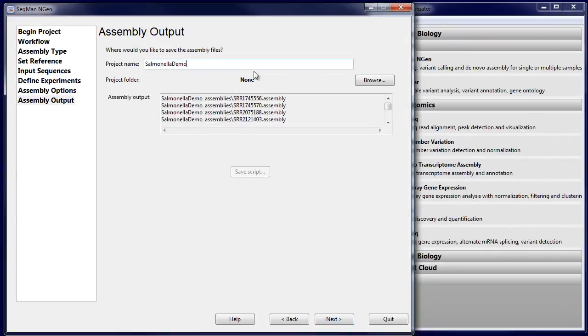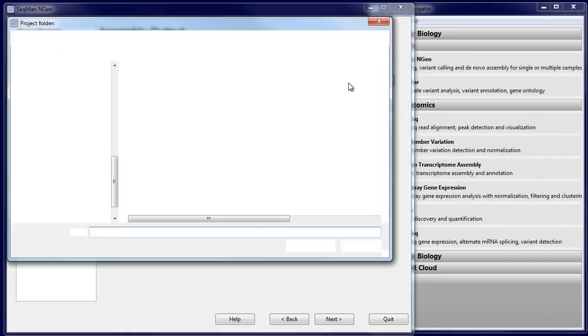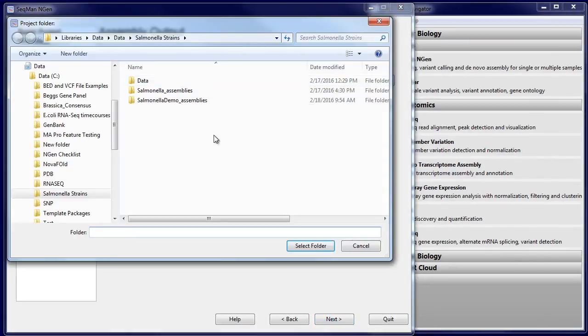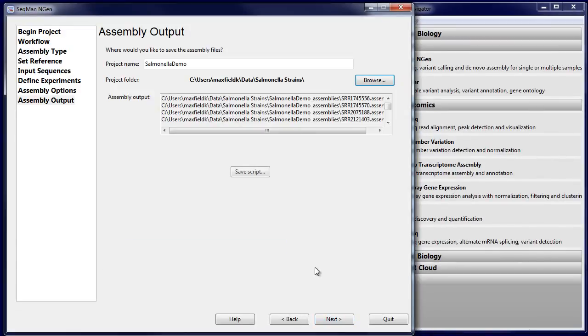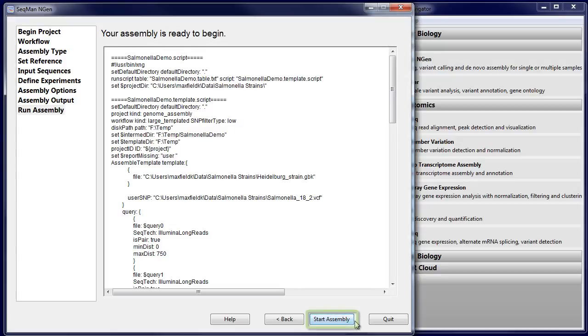Then, name your project, select a project folder, and start your assembly.